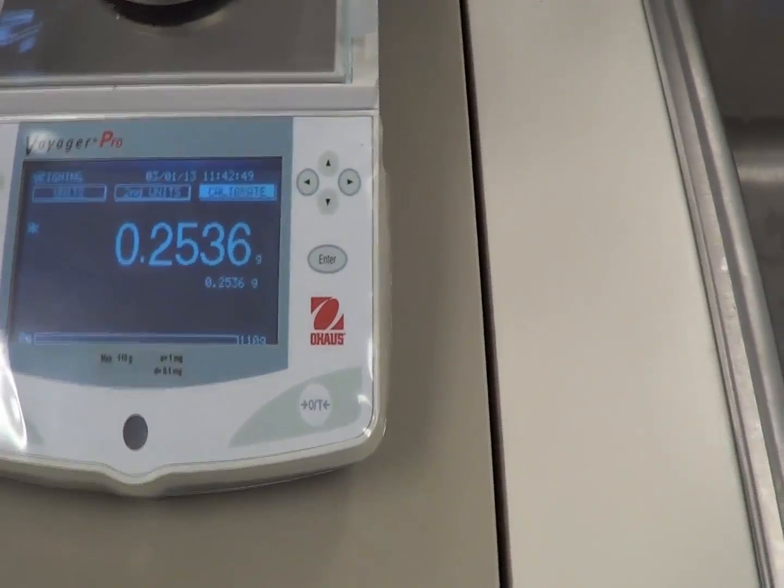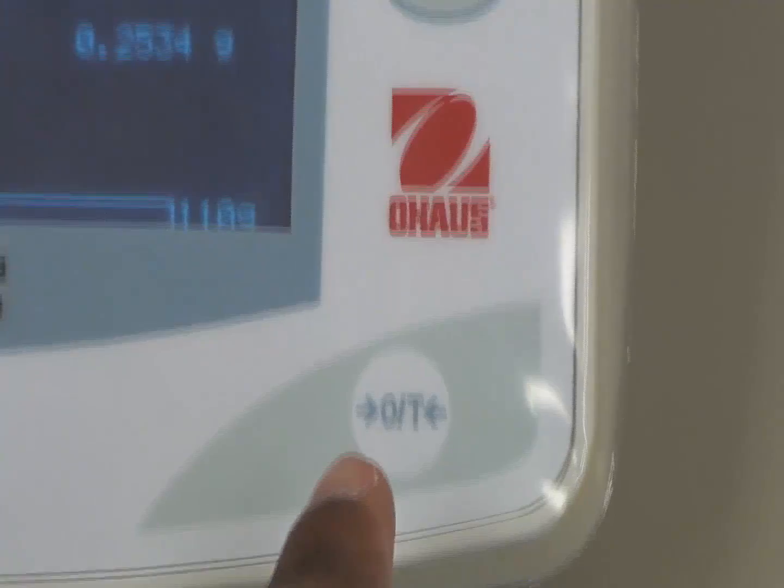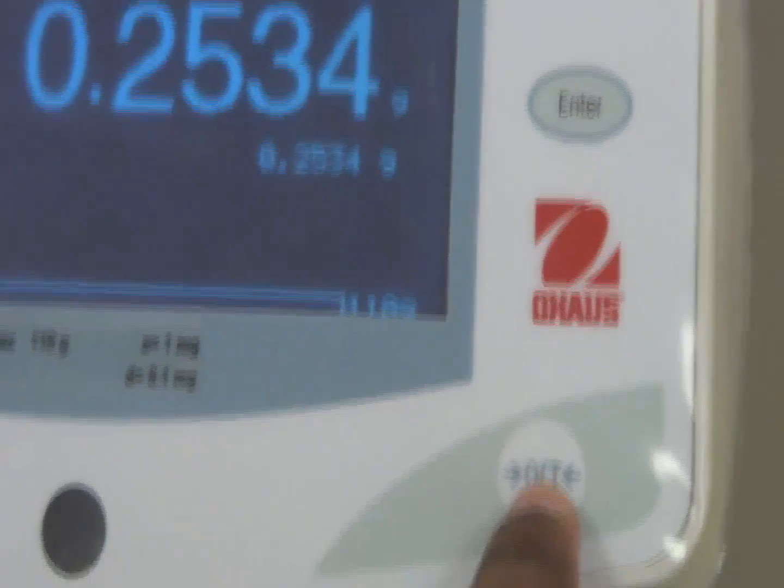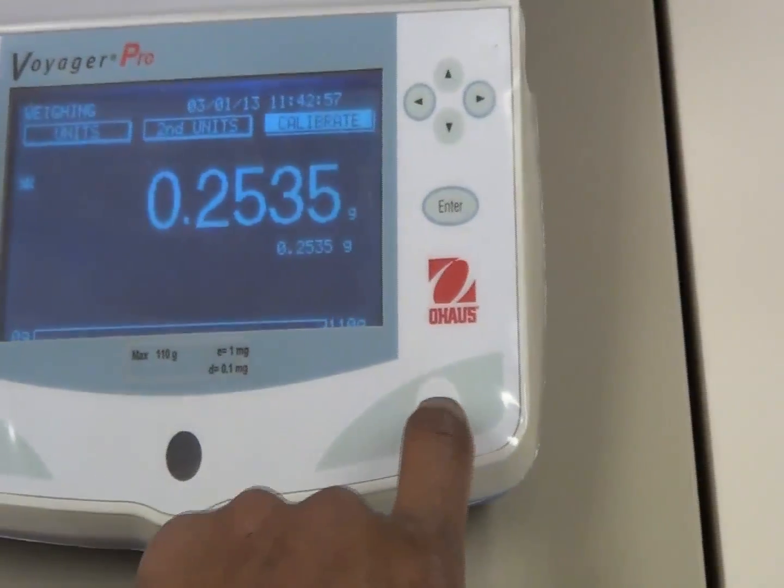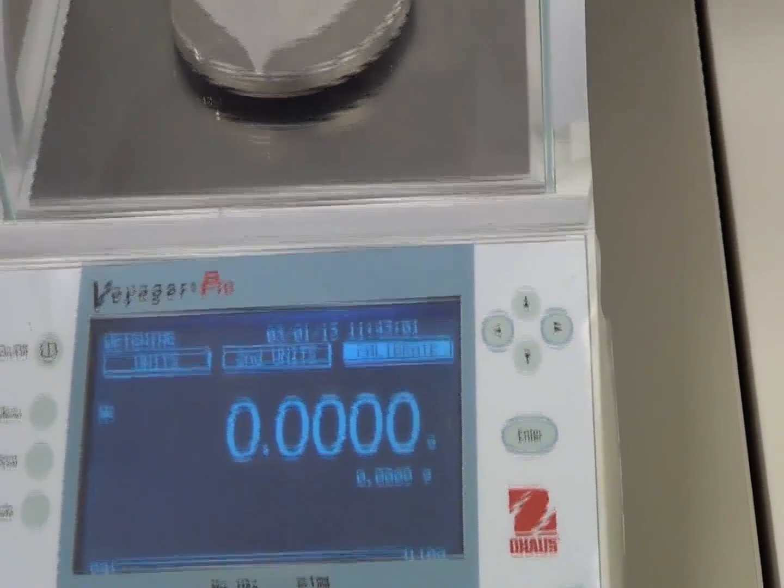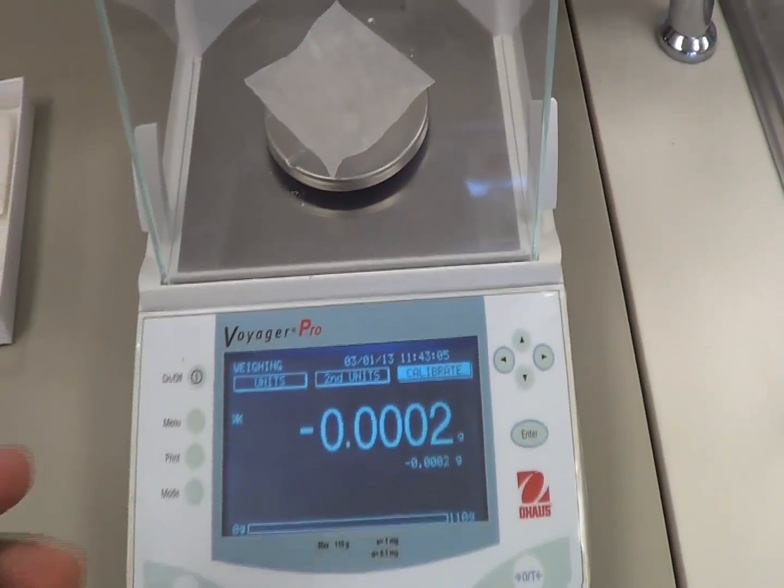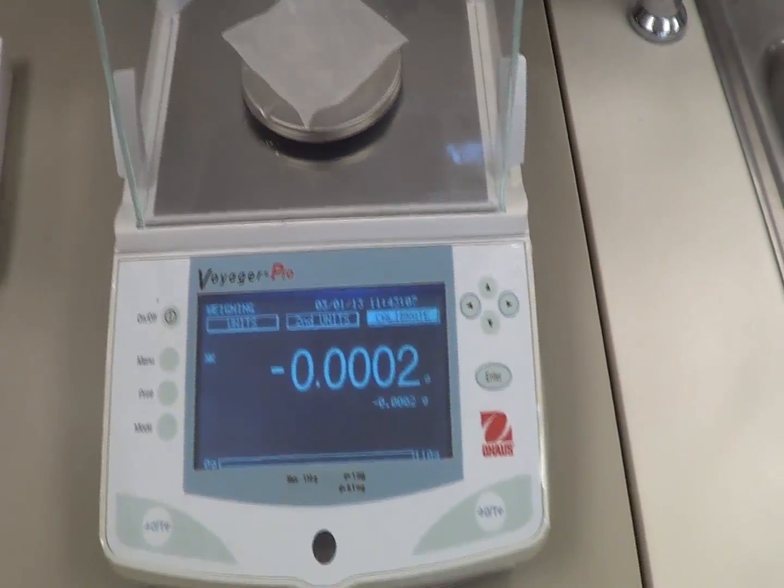So again, go back to this zero. Zero this weighing balance. Press the zero. If you press it, it's going to show you again zero. That means now you can put the drug, whatever, and weigh it, and you can calculate the weight of it.